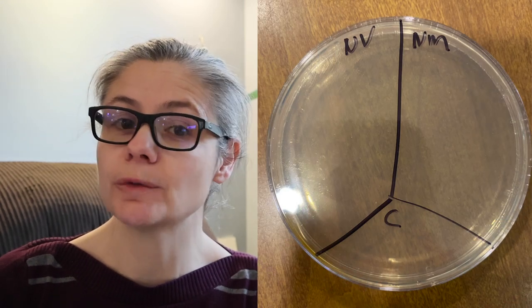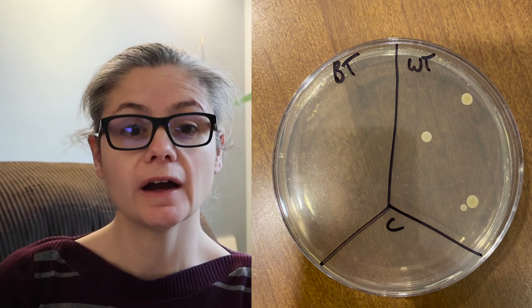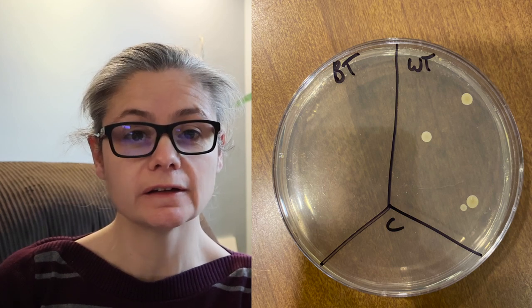Week one, flushing with the lid up, near the vanity and near the mirror, both have no bacteria growing. The wall by the toilet paper as well as above the towel rack both have no bacteria growing there. Behind the toilet had no bacteria growth. However, the wall next to the toilet had four small bacterial colonies. So after week one with the lid up, the only wall that I sampled that had any bacterial growth was the wall next to the toilet.